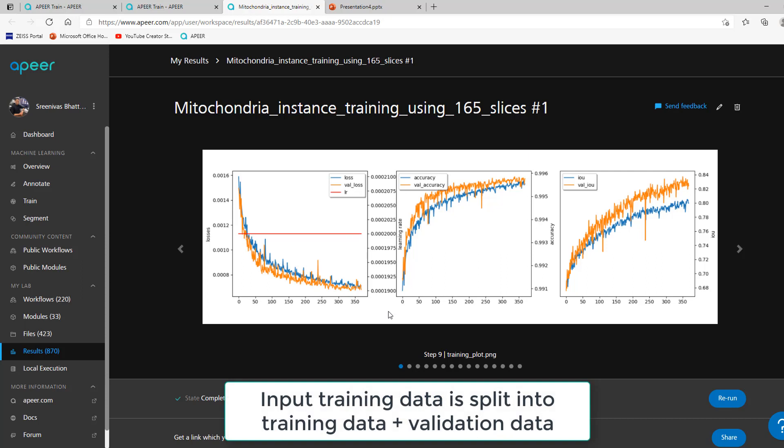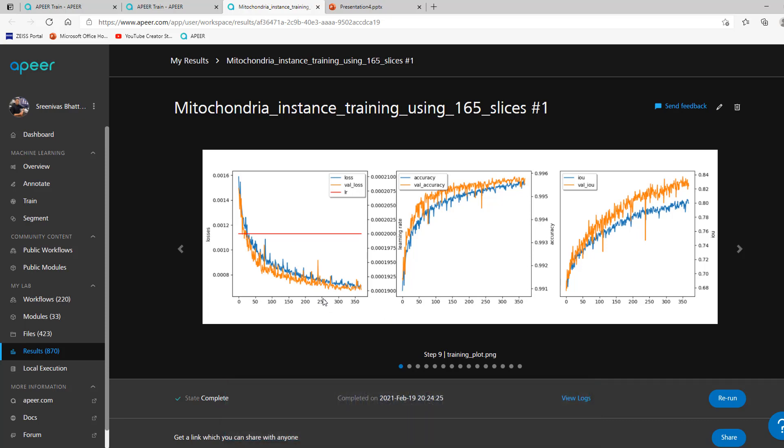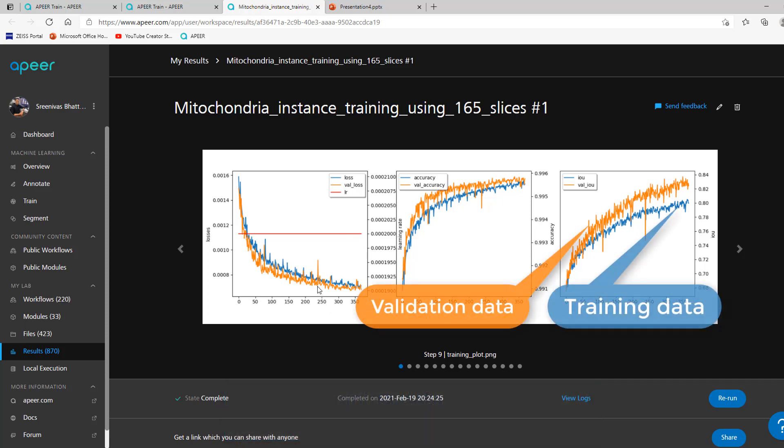One is used to train the model and the other used as ground truth for validation. In these plots, the blue line represents the results from the training data and the orange line represents the validation data.